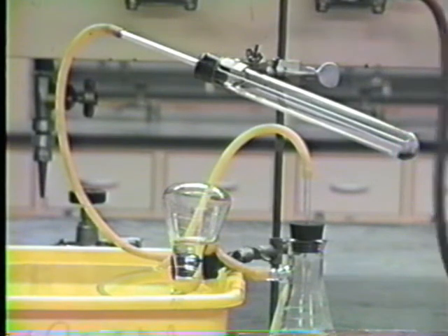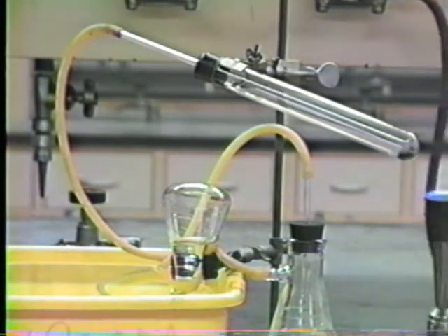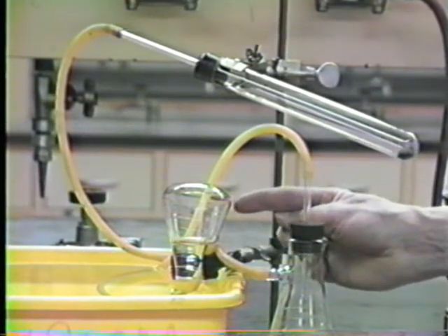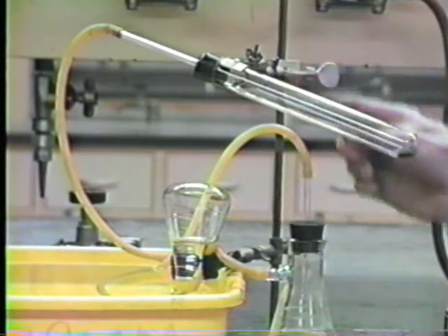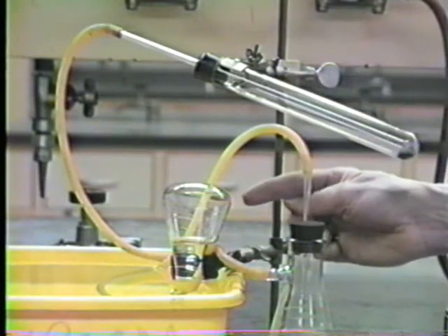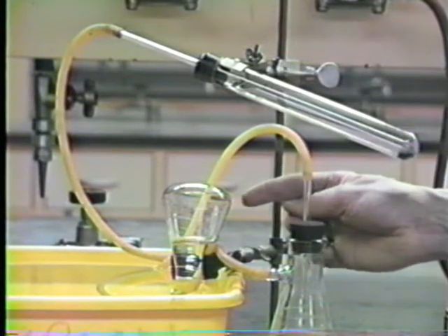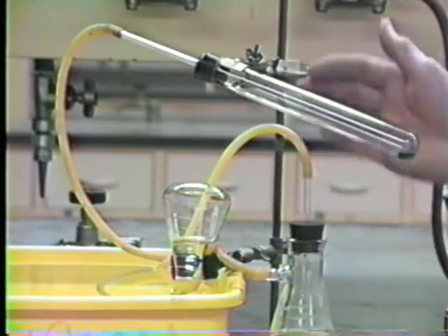The tube has become solid. We can stop the heating at this point and let the whole system cool. When the system cools, the air which came into this flask due to the heat expansion here will be drawn back into the surge bottle and into the test tube here.